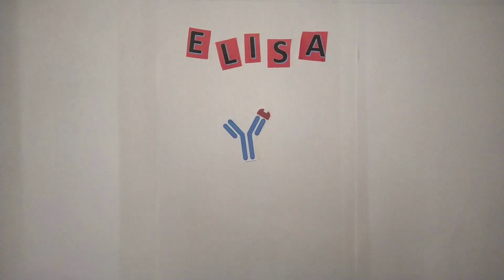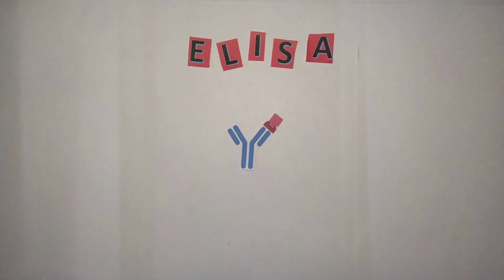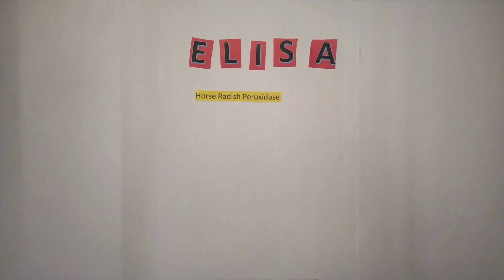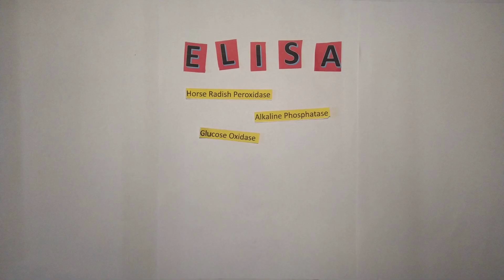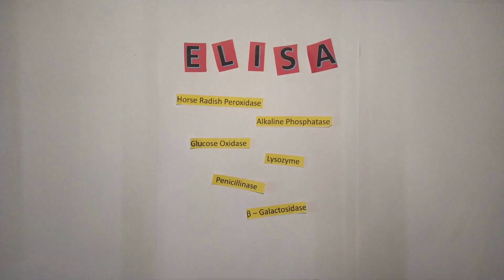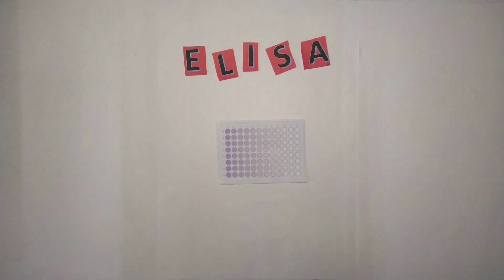In ELISA, we use enzyme linked antibody, which, when reacted with a specific substrate, gives a colored reaction. The enzymes generally used are horseradish peroxidase, alkaline phosphatase, glucose oxidase, lysozyme, penicillinase, and beta galactosidase. ELISA is generally carried out in microtiter wells.